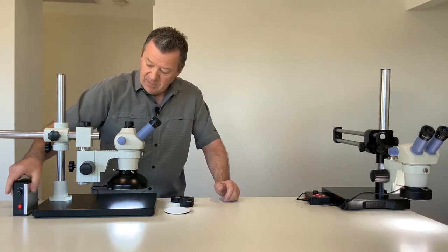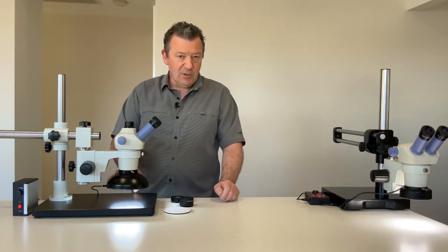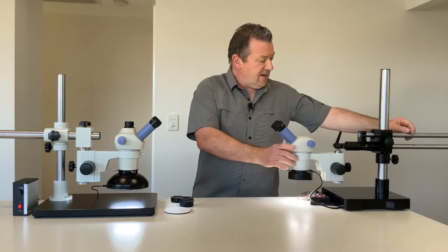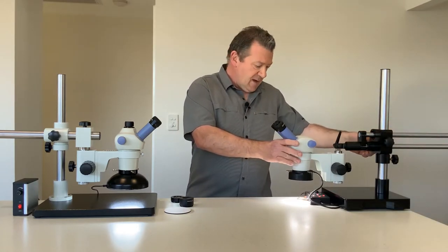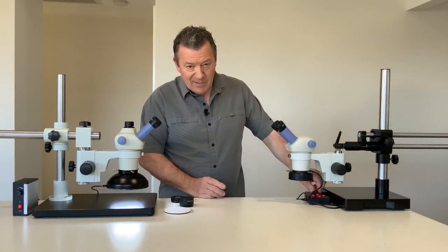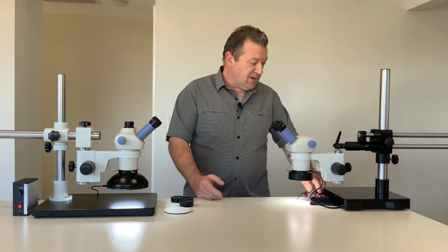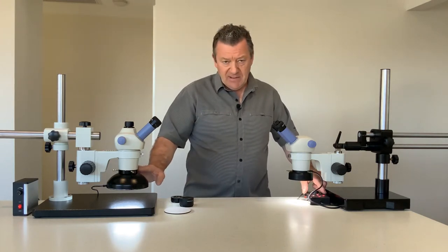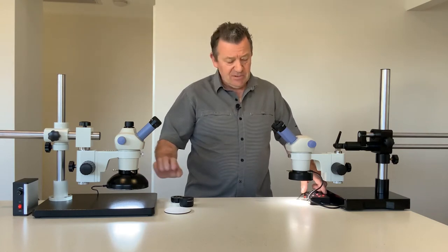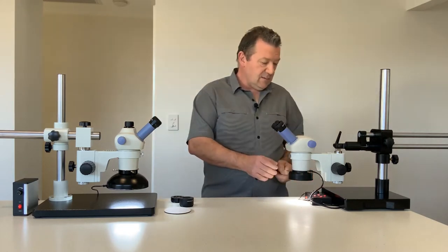On our website we have comparison images showing the difference between using the dome illuminator and the LED ring lights, which we have on the larger boom stand here. The LED ring light is variable intensity and has 72 LEDs. My personal preference would be the dome illuminator — it's advisable to visit the website where we have comparison images taken with both the dome and the LED ring light.